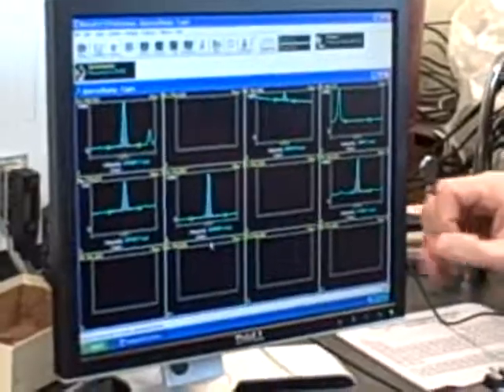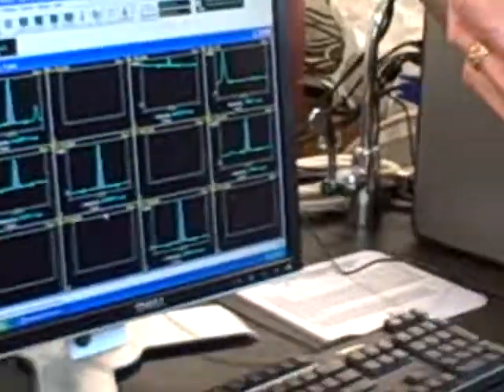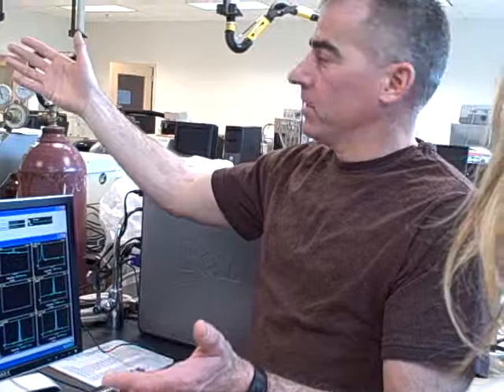Anyways, what you get off that plasma is literally thousands and thousands of emission lines, but very few of them overlap because of how sharp the lines are. The emissions happen between 180 nanometers and maybe up to 700 nanometers or so, over maybe 500 nanometers is what we're looking for emissions at. If we can get resolution down to even a 100th of a nanometer, you can theoretically see like 50,000, 100,000 different lines there, and not a lot of them overlap. So you don't get much in the way of interferences.